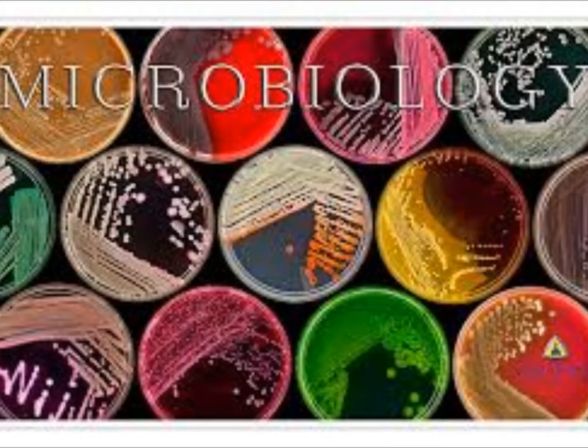Let me go do the plates and get it in the incubator. At least tomorrow we'll use this one, but then we'll sub it to the blood and CNA so they can see what happens on that, and the MacConkeys, just so they see it doesn't grow. We can give that to Leah, because she can help with Chris, see Staph aureus as well, all 3 plates.